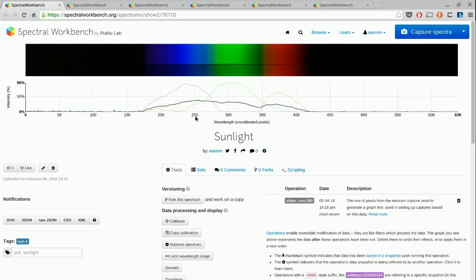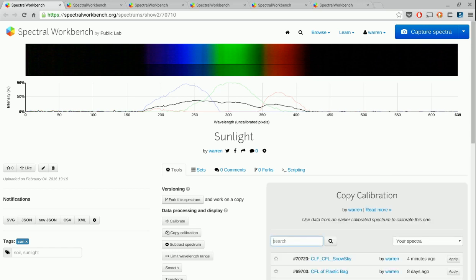What we'd like to do is know what wavelength each of these pixels is. And as you might have seen in the introduction video, the way we do that is we copy a calibration. I took a calibration fairly recently, or just before I took this spectrum, and I search for it here, and I click Apply.